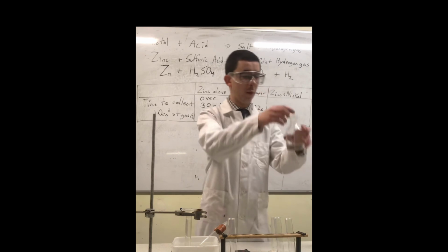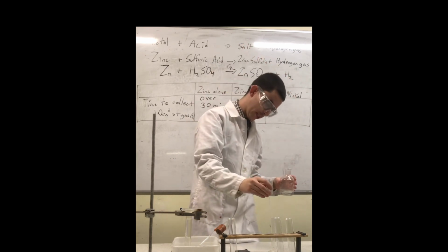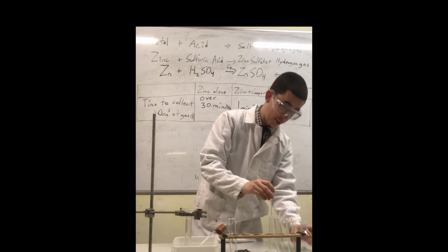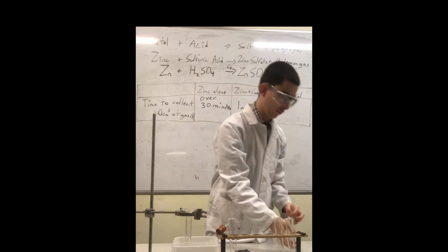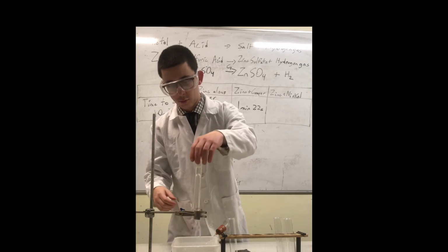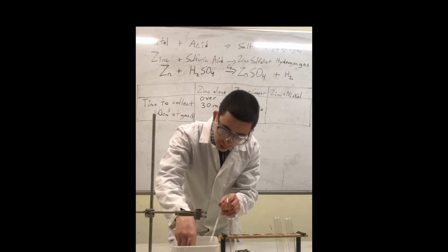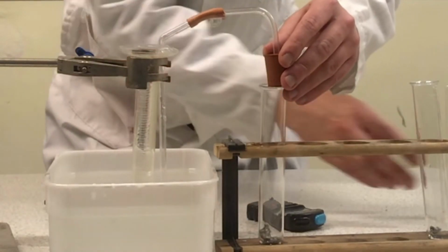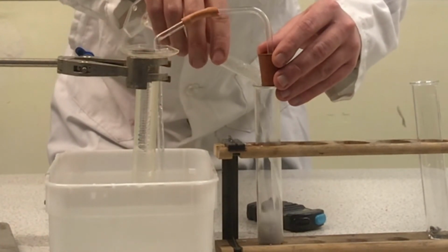We'll also, once again, use my pipette to remove the sulfuric acid from its container and measure 1 centimeter cubed of the acid in my measuring cylinder. Now it's important I refill my measuring cylinder with water so that I can see the gas displace. Just as before, as soon as I add my acid, I will have to start my timer.